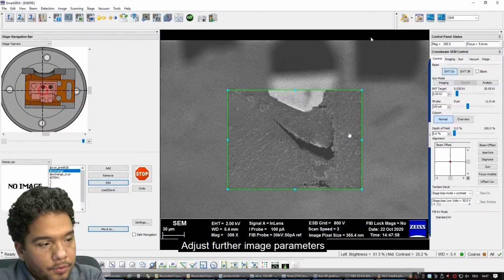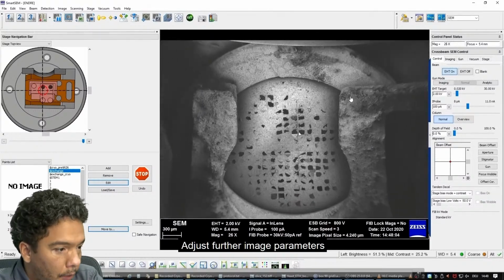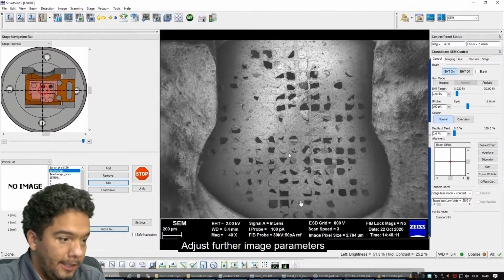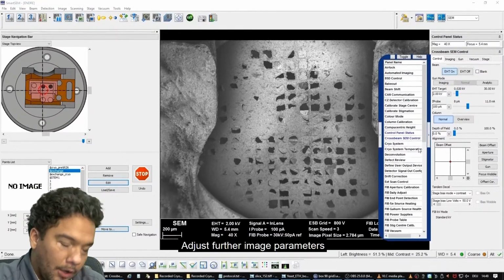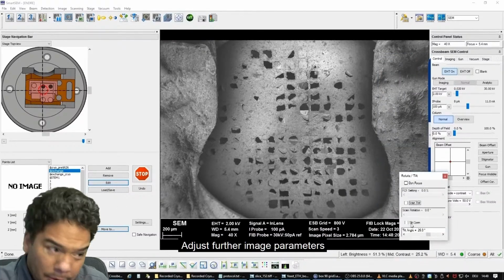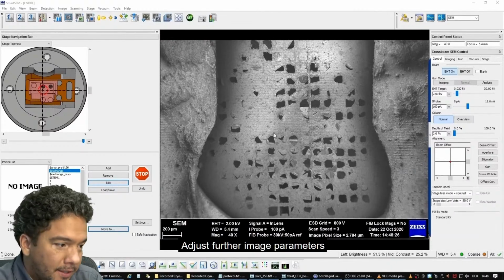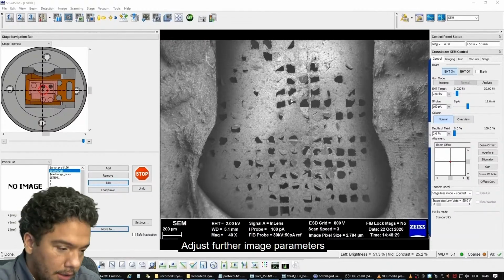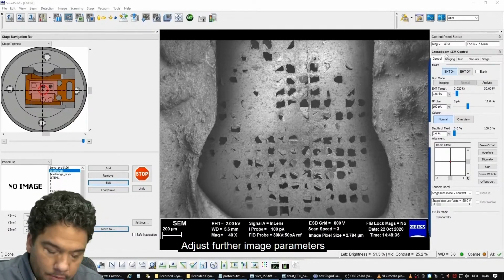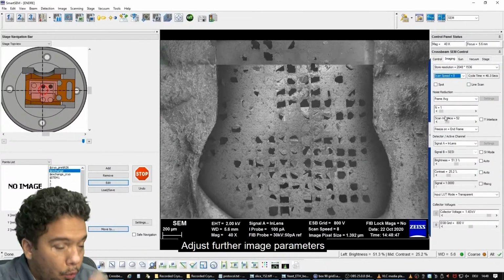Okay, first we are collecting some images here. We load the sample. This is how the grid looks. But now, in this big area, in the context of microscopy it's a big area, where is the specific target, the specific site that I want to mill that I previously acquired? And so with the confocal microscope, now I want to reach that point.